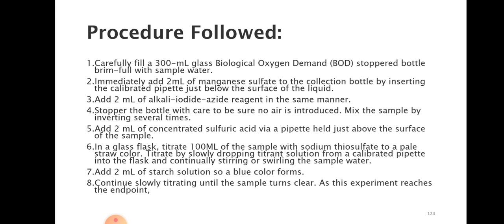After that we are going to add 2 ml of concentrated sulfuric acid. When we are adding the sulfuric acid, solution becomes clear brown color. Now we are going to take 100 ml sample from this and we are going to add sodium thiosulfate till it becomes light yellow. Then after we are going to add starch as an indicator, solution becomes blue, bluish black. Again we are going to add sodium thiosulfate continuously till the solution becomes white color or colorless.